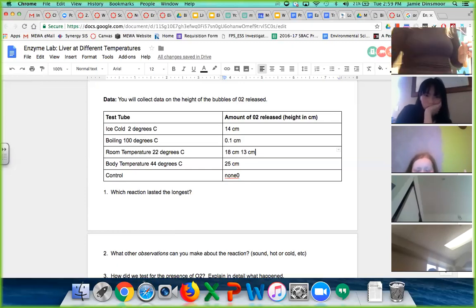Right, in case you forgot, as a reference, this is what it looked like before. Kind of hard to see on this computer camera, but does anyone notice anything about the liver itself? What is happening to it? It looks nasty. Hey, that's a description. Yeah, it kind of does, right? It's yellowish. It looks cooked a little bit. All right, so a lot of us said we thought boiled liver was going to be the best. We got our hydrogen peroxide.